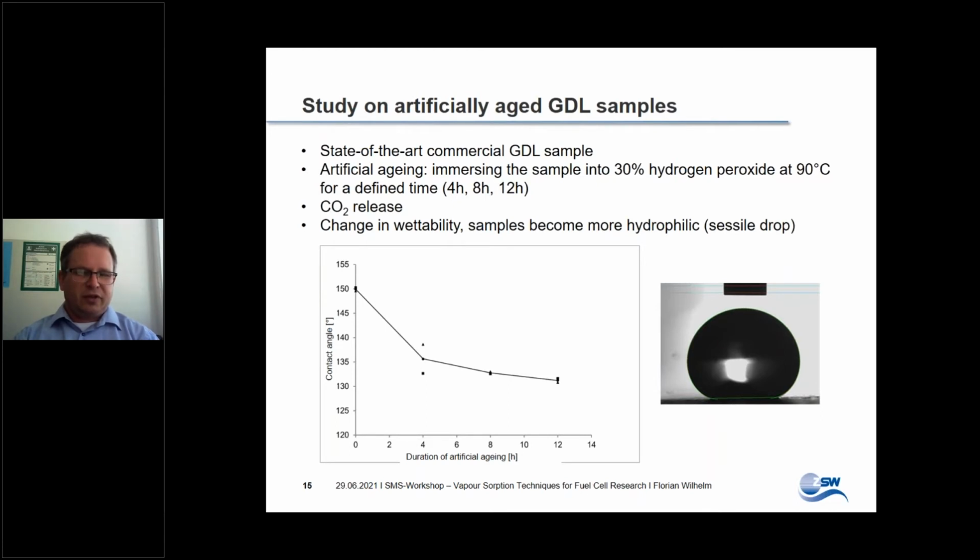Just as background information, this contact angle you see here with the sessile drop method has a strong impact from the surface geometry. So the so-called lotus effect, describing the phenomenon that you get much higher contact angles than for pure flat material once you measure on corrugated surfaces, also comes into play here. Pure PTFE with a flat surface would have around 113 degrees of contact angle.